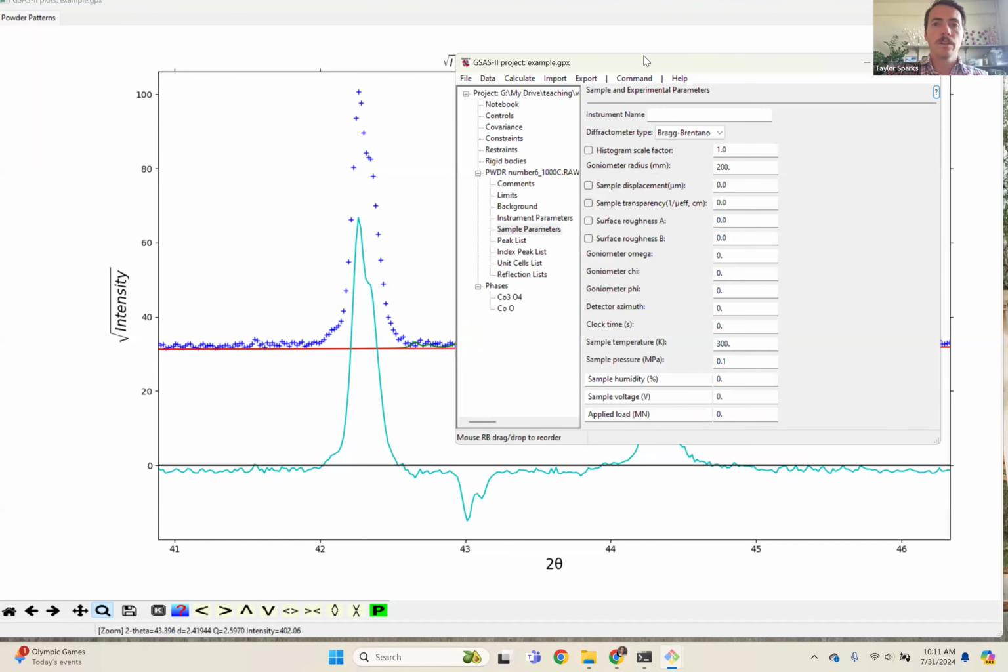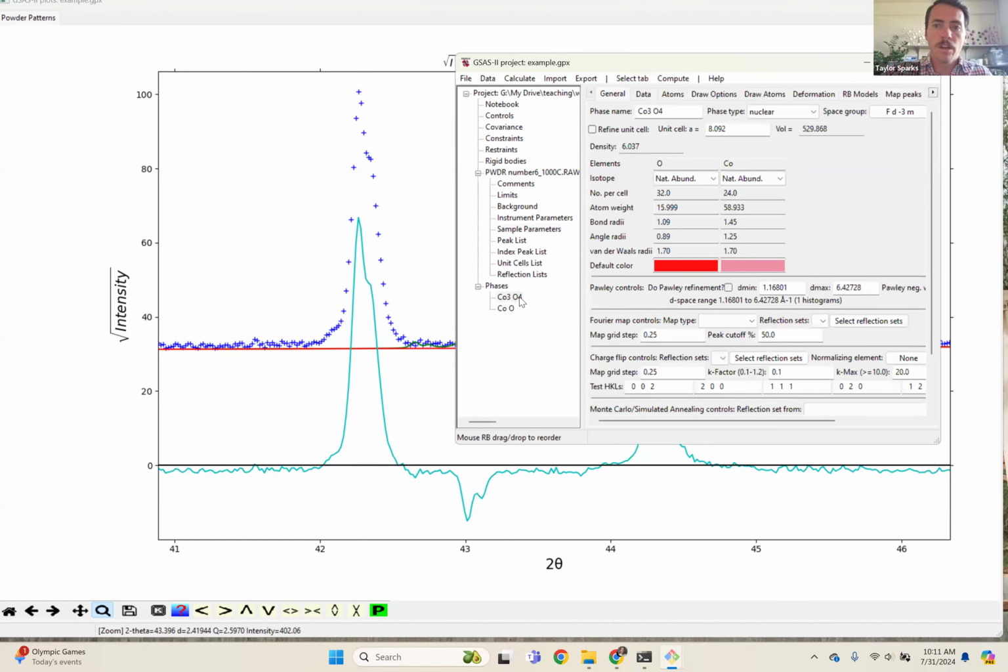Well, you can manually change things. We know that the lattice parameter needs to be bigger, so let's just try bumping it up a little bit. Let's imagine it goes up to like 8.3. It was at 8.1 basically. Let's increase it to 8.3. Same thing over here. It's at 4.26. Let's bring that up to like 4.5.